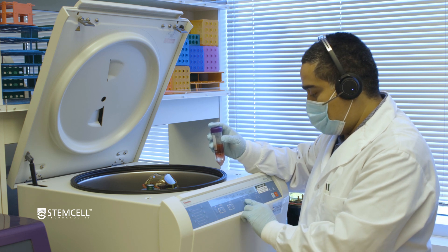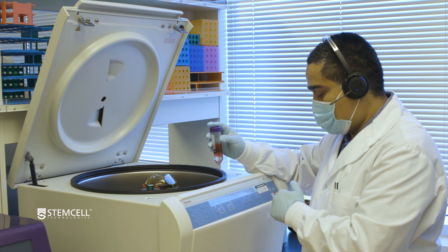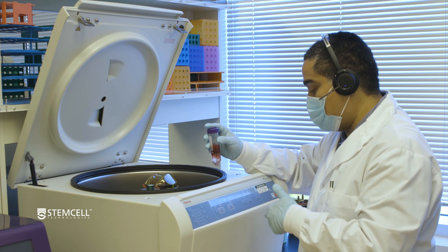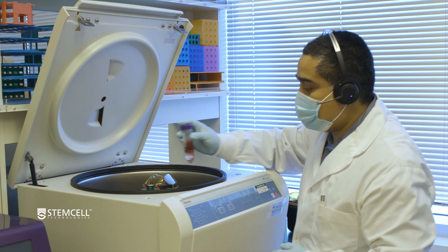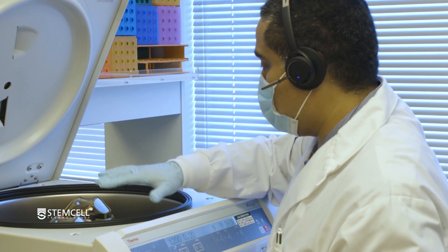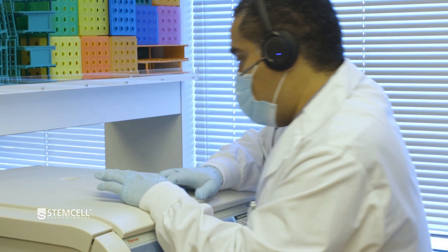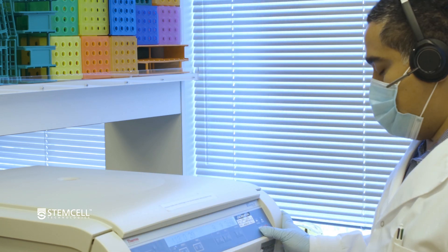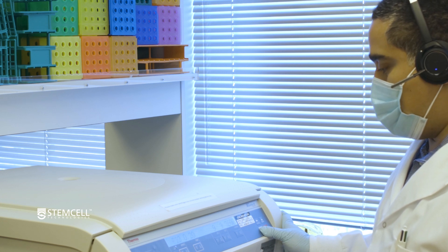We're going to set the acceleration to 9 and the deceleration to 9. If you have an instrument that allows you to set the deceleration to 8 or 7, you could adjust it if you wanted to. However, it's perfectly fine to have it at the top deceleration setting when working with CEPMATE. Make sure your tubes are balanced, then close the lid and hit start. It's always good practice to wait for the centrifuge to get up to speed before walking away.